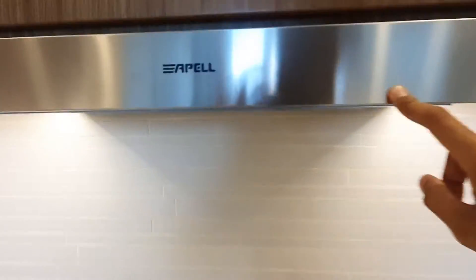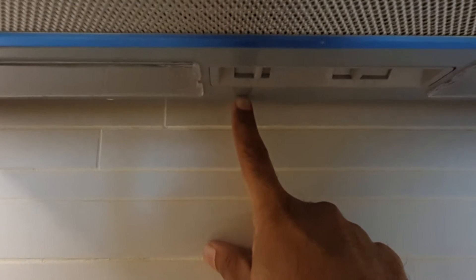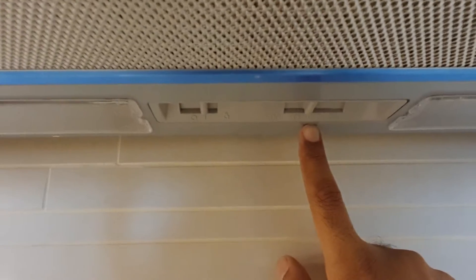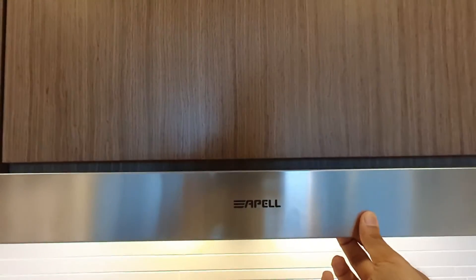This is how we use the hood. Please make sure that the light is switched on and the fan speed at one. If you activate the hood, please pull it out like this.